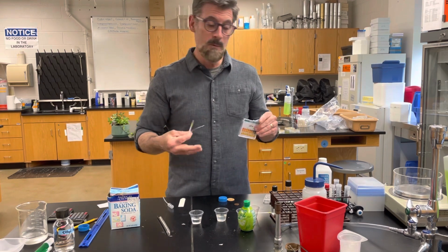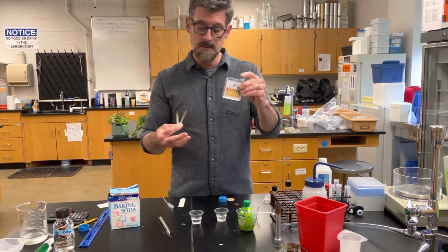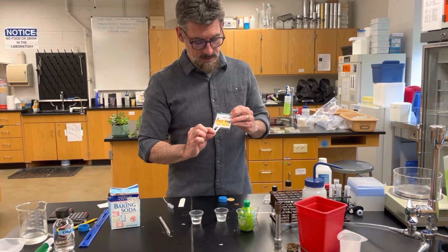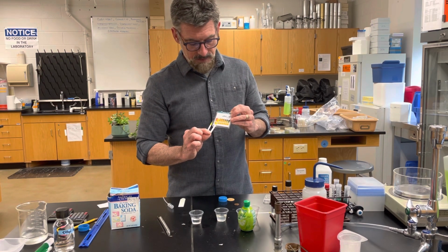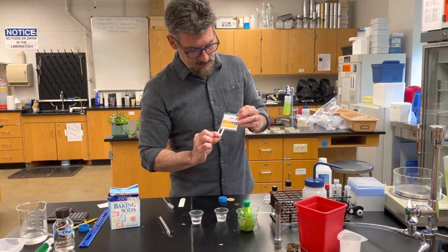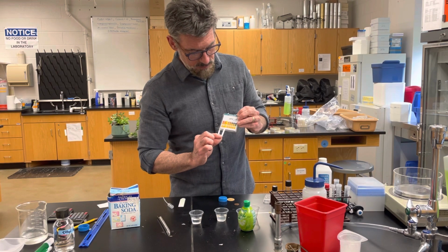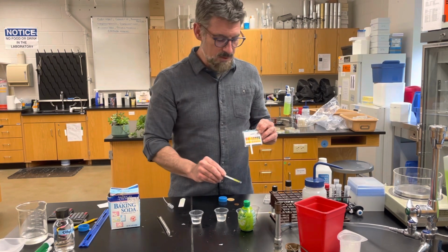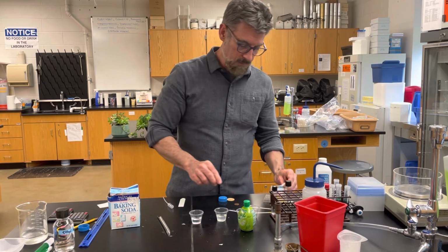The ones that I gave you, I've tested out more so than these, and they work very well. They're a little more accurate, so you're going to see this. So this is a low pH. If I have to guess on it, you can kind of see the first one's like a yellow, the second one is sort of a greenish one, then there's an orange one here. The top one is the one that's most confusing. Somewhere probably between pH 2 and 3, it looks like, what we're seeing.